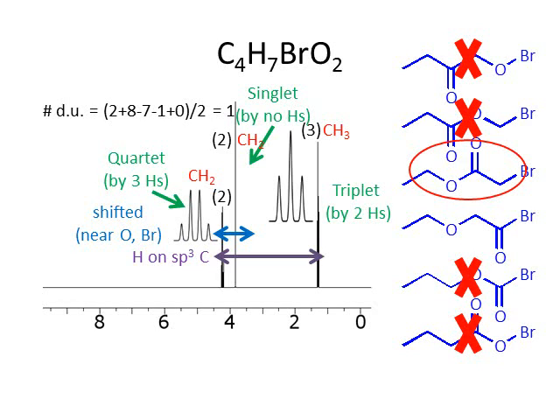You could also turn to tables and look things up and figure out where exactly the signals would come in each of these cases, but again, that would be fairly advanced because you'd have to look at a bunch of different tables to figure out where exactly this sort of signal would come and where exactly this sort of signal would come. All right, that's proton NMR.